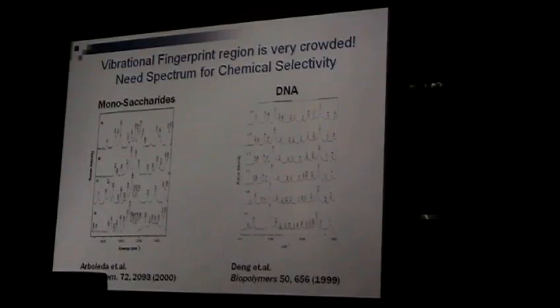Good news is we know how to interpret it. Because Raman has a great database and there were a lot of studies. So we know, and these days we can calculate all these vibrational peaks. So in theory, we can use all these things, but the requirement is you have to get the spectrum. Otherwise, you cannot tell what you are looking at. For example, 1000 wave number can be phosphate, but it can be benzene distortion, right? So without the entire spectral shape and other peaks, you cannot say you have chemical selectivity.